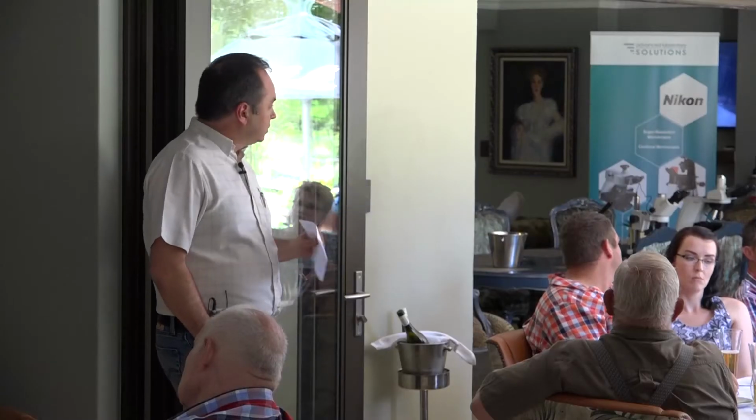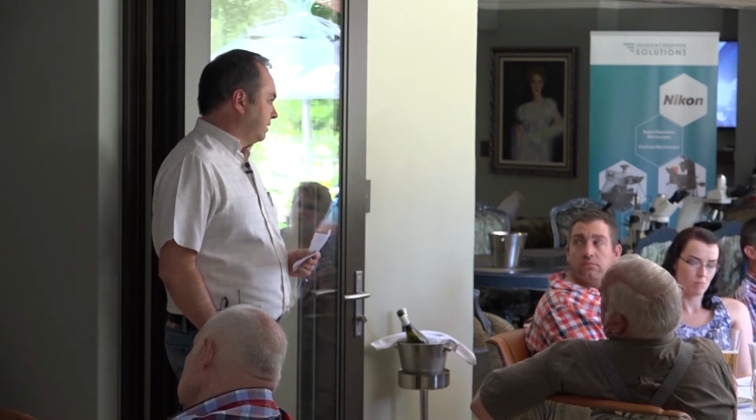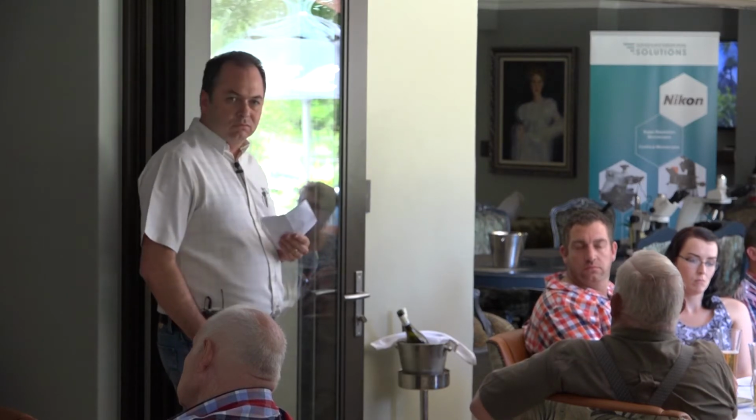So that comes into the photographic side. Today it's digital cameras, okay? And again, for a decent application to be able to see what you need to see, you should be able to spend less than 10,000 Rand on a digital camera. So for 20,000 Rand, 10,000 Rand for the microscope, 10,000 Rand for the camera, you would have a more than sufficient system to be able to work with. There's a lot simpler systems around that are adequate for what you need.